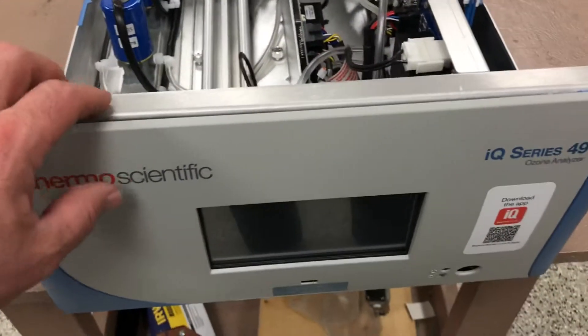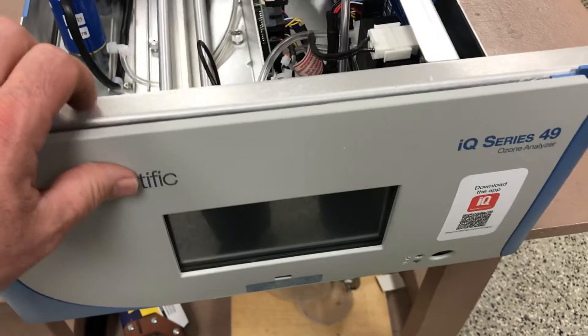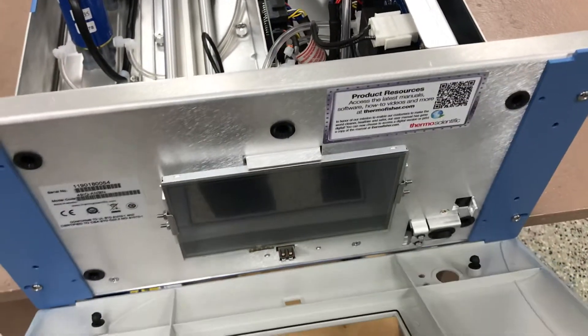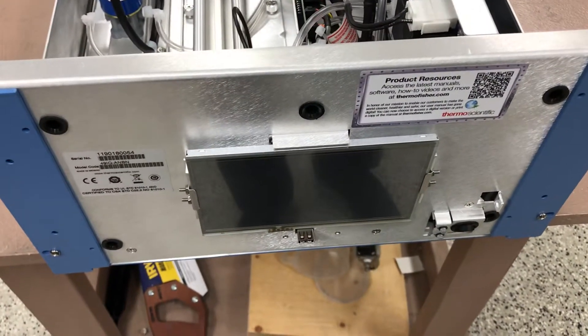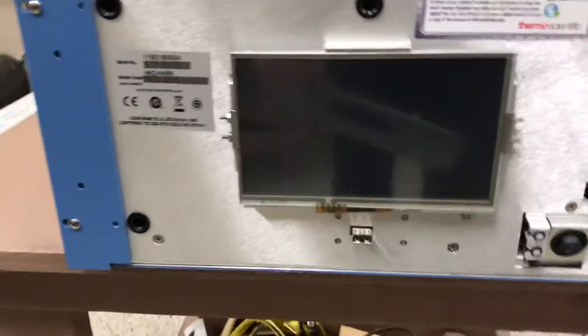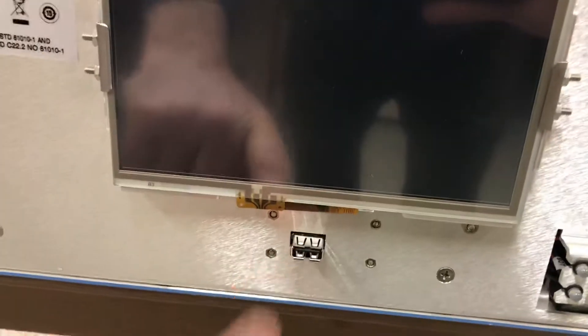Going back around the front, you can still pull off the front panel for easy access to the display if you ever had to service it. Just pop that off for quick maintenance if you ever had to troubleshoot the touchscreen display. Here's a better look at the front of the instrument — your power switch and the USB port right here.